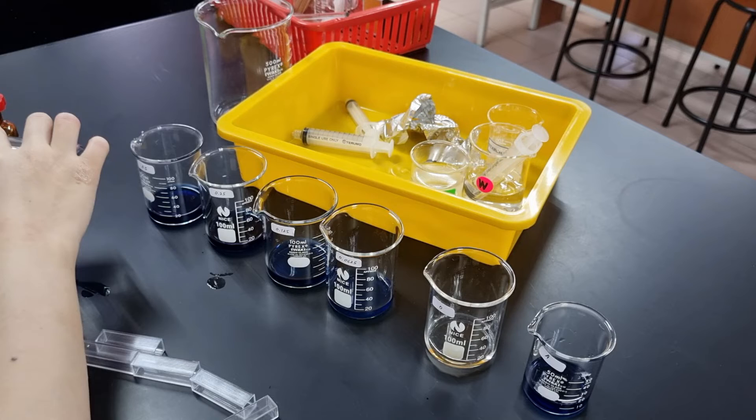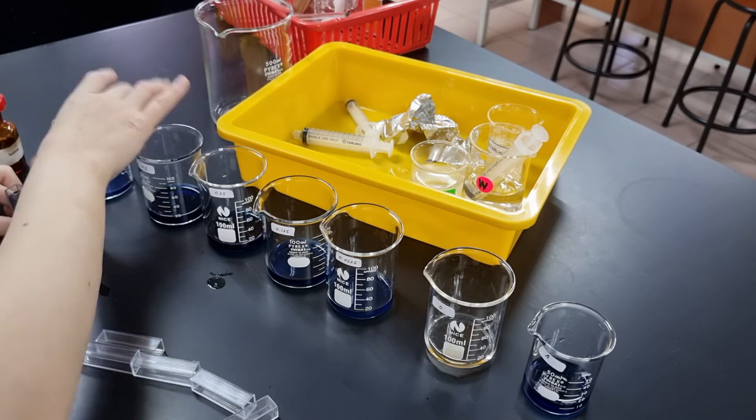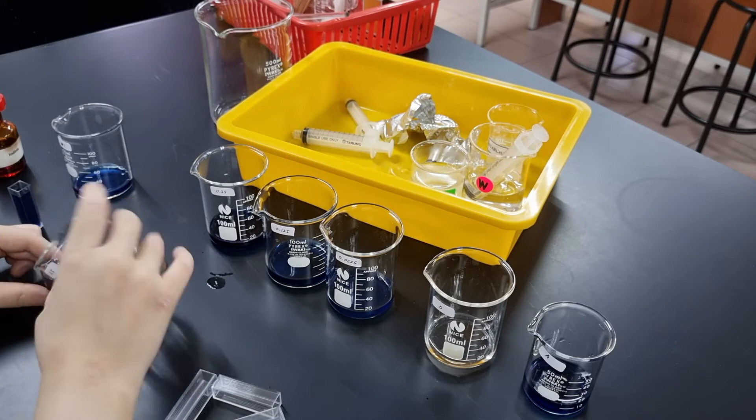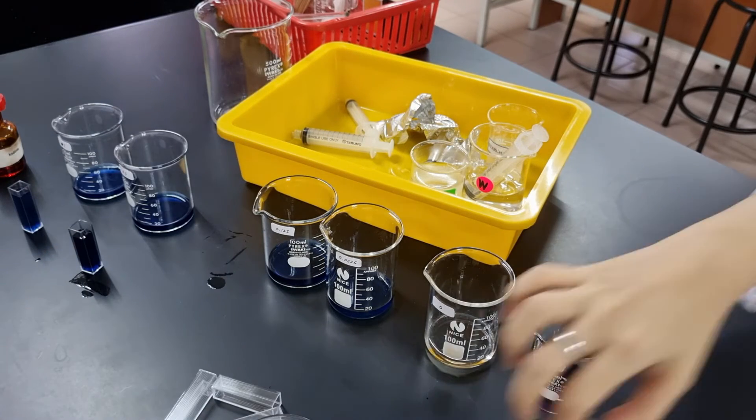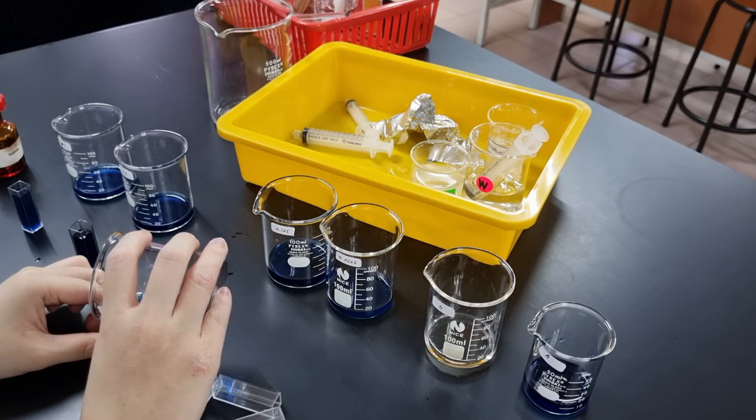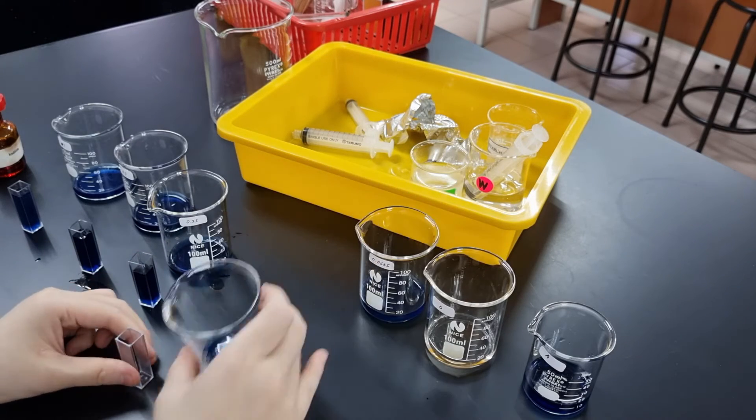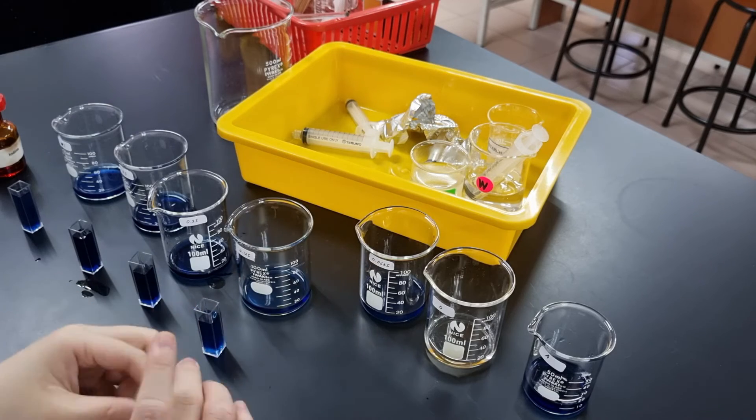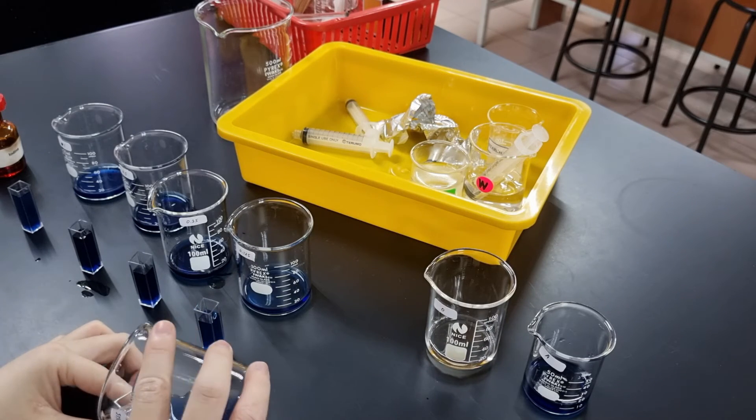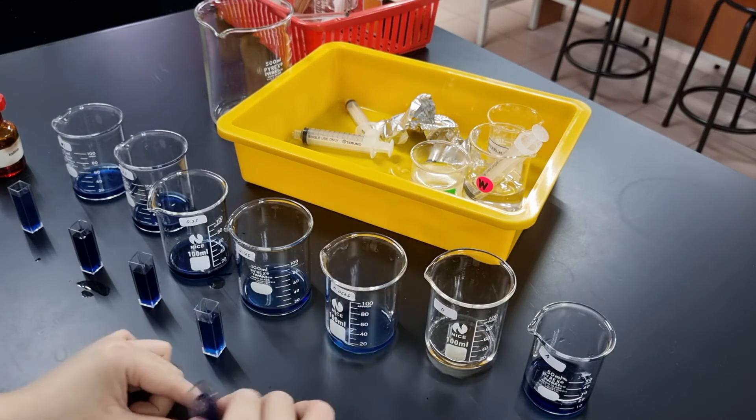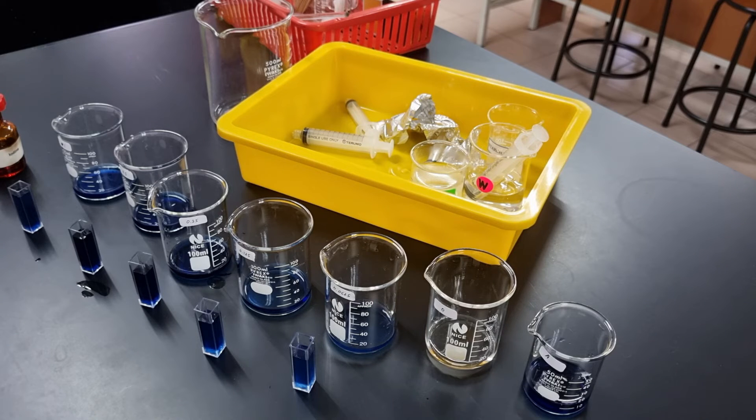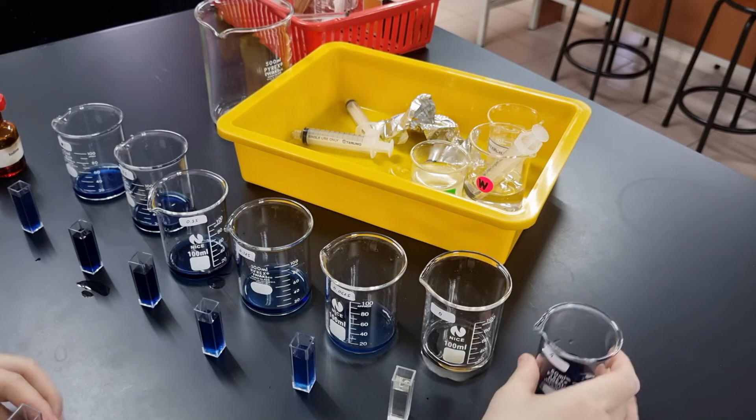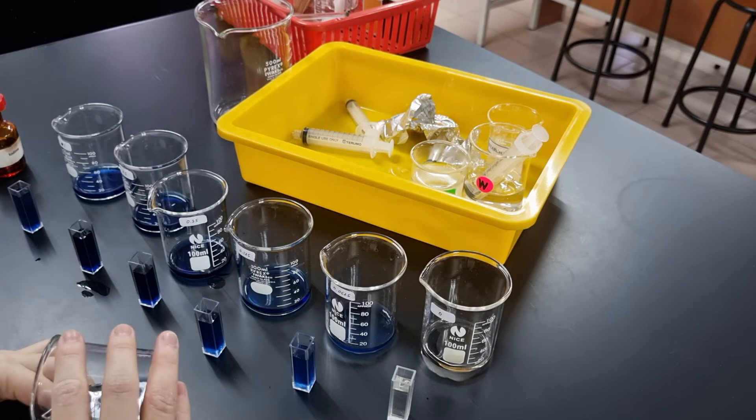This is me then transferring the liquid into cuvettes, which we'll be using later in the spectrophotometer, and this is just because it's easier to see the color and the intensity through the cuvette. 0% is just distilled water and some iodine, so it will be a little bit yellow. And that's our results.